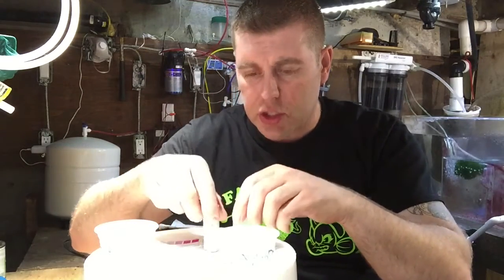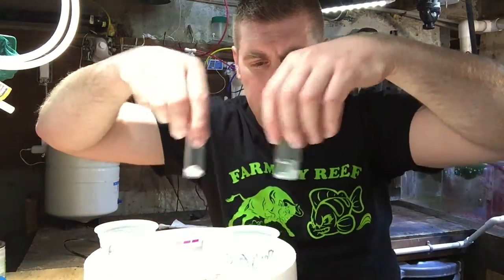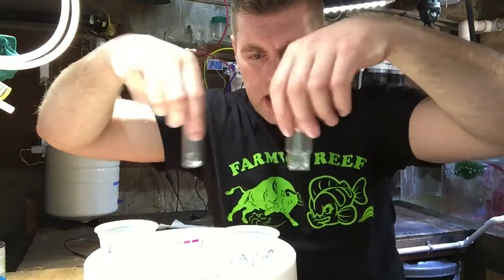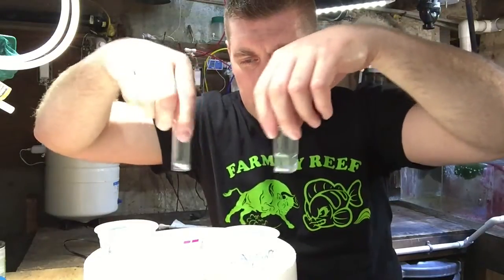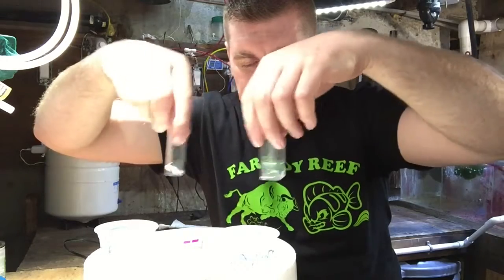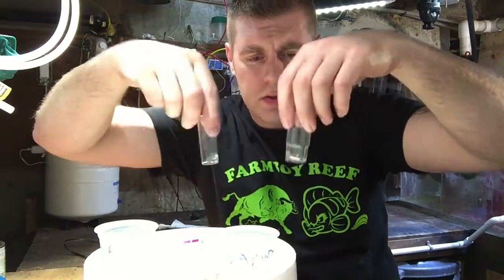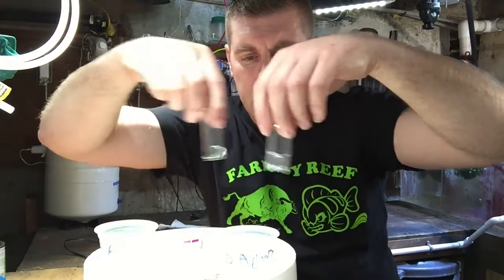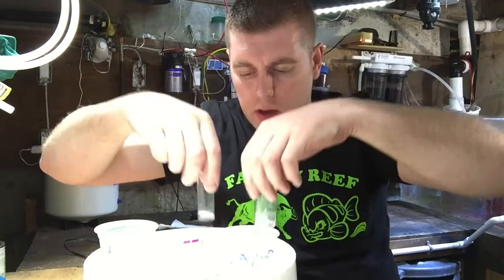Now take the vials and stir them for 30 seconds each. After stirring, the instructions say to wait three minutes — just three minutes, not five or ten. So we take a break and wait. It's been three minutes, so now we're going to compare to the chart.